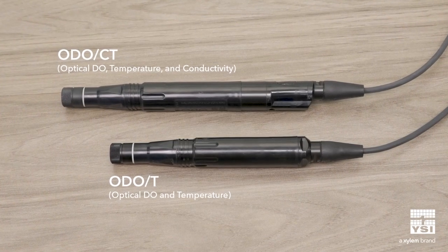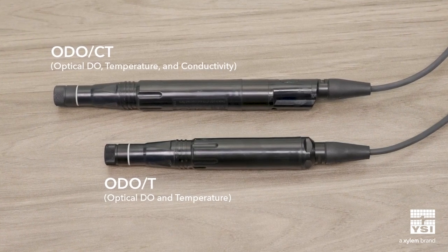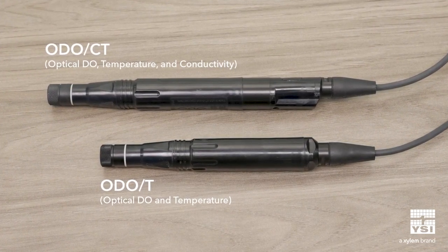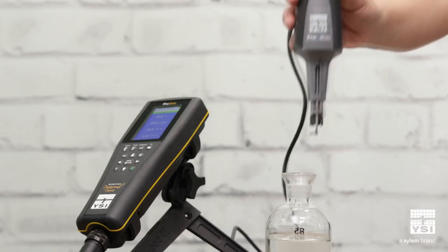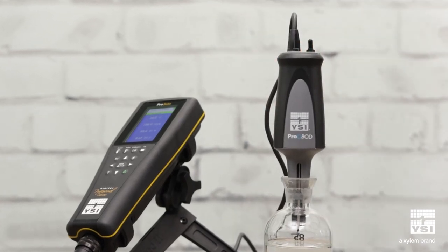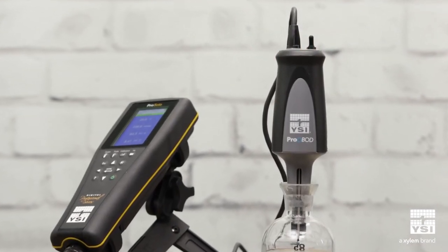The ProSolo offers more parameters than the ProOdio. With the ProSolo, you can get a dissolved oxygen probe and cable with an integrated conductivity sensor that also calculates total dissolved solids and salinity. Adding conductivity also allows for real-time salinity compensation of the dissolved oxygen measurements. In addition to field use, the ProSolo can be used in the lab with our ProOBOD probe for laboratory BOD testing.